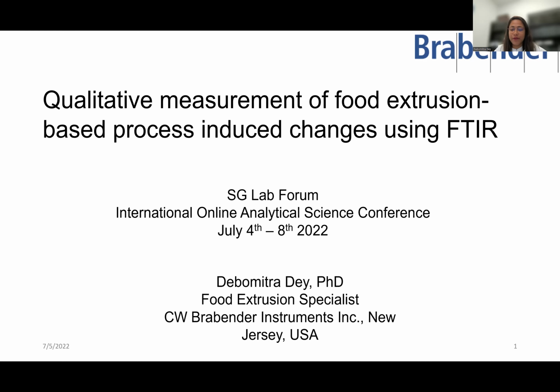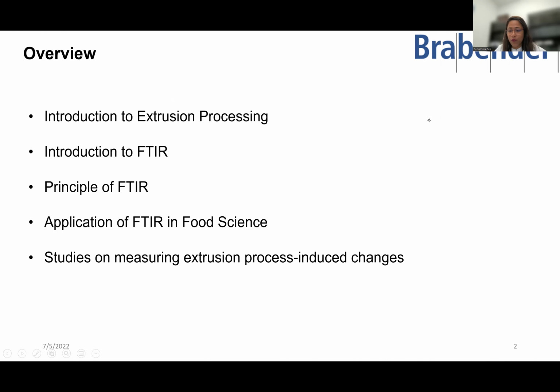So to begin with, I'll be giving you a brief overview of my presentation. Firstly, I'd like to talk about what extrusion processing is, and then I'll quickly move into the introduction of FTIR. I would not take a lot of time talking about FTIR, the principles and the introduction, but the main focus of my talk would be more on how food scientists are trying to use FTIR, especially when it comes to understanding the process-induced changes during extrusion.